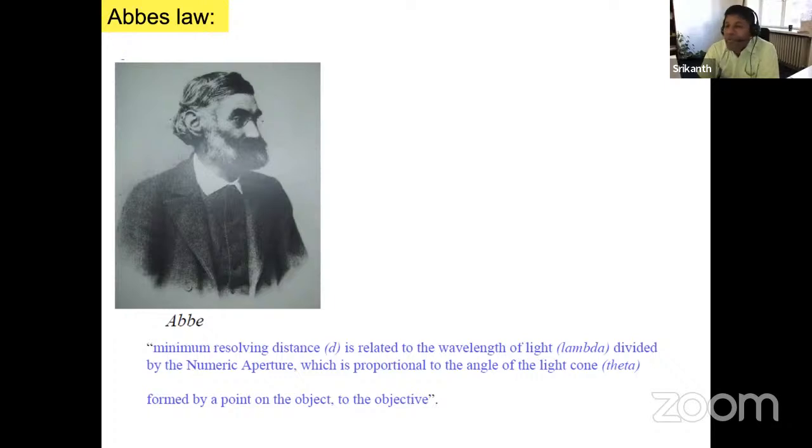So somebody proposed some law a long time ago, and then all the researchers, the whole community in the world, are trying to follow the law. But somebody came all of a sudden and said, no, we can also break the law and try to resolve something. And that is how super resolution microscopy was discovered.